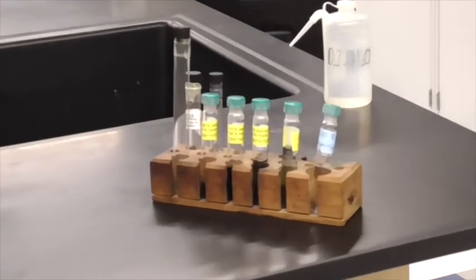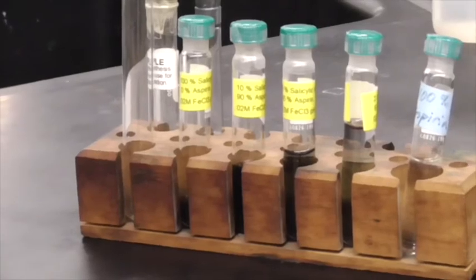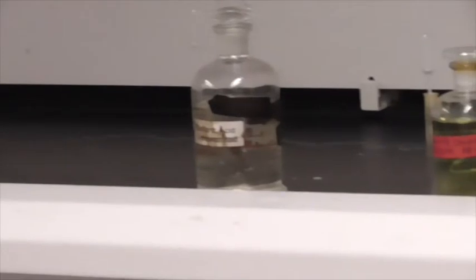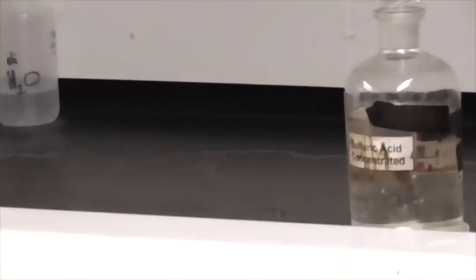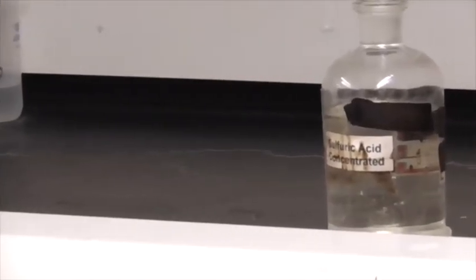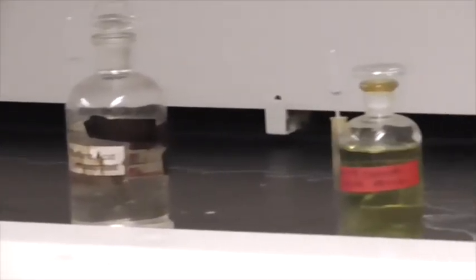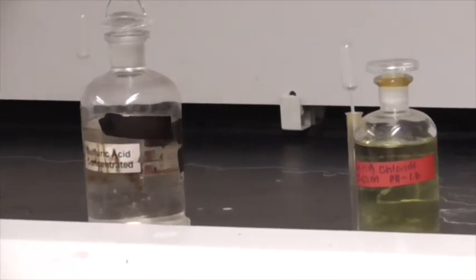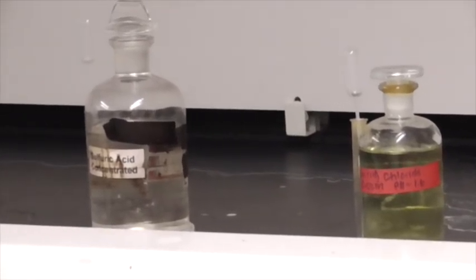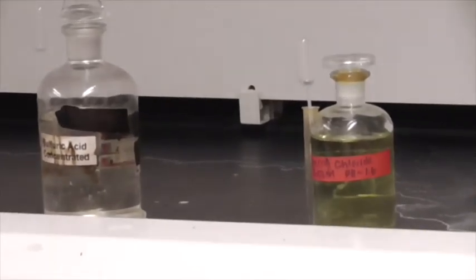This is going to be a comparison so we can determine how pure our product is. And then two other chemicals we're going to need are in the hood. We have the sulfuric acid right there. It's concentrated sulfuric acid. It's really corrosive, so that's why it's in the hood. And next to that is the iron 3 chloride, which is also in acidic solution. So we've got it in the hood. We're going to use that to test the purity of our product.